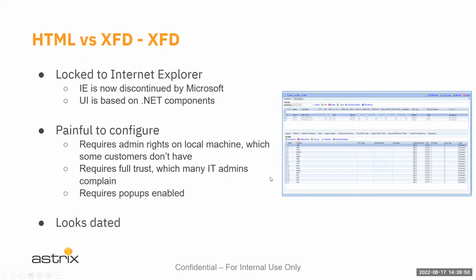So yeah, I mentioned this already, but let me use the PowerPoint to re-mention it. So the old XFD was locked to IE. Okay, so IE, as we know, Microsoft wants to move away from it, right?